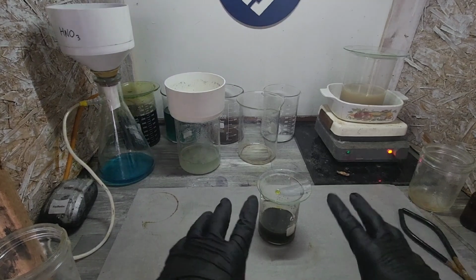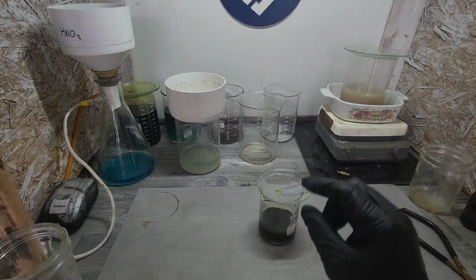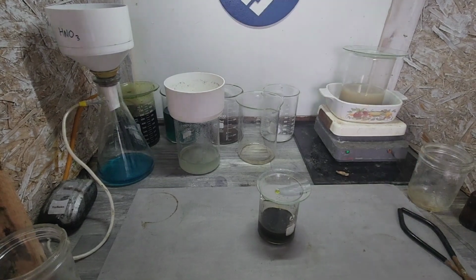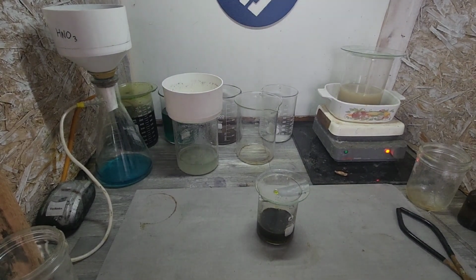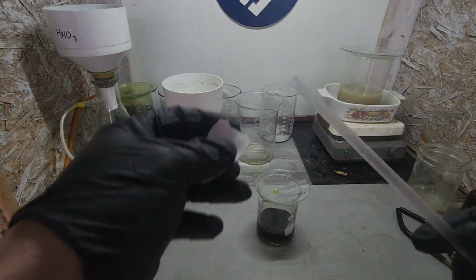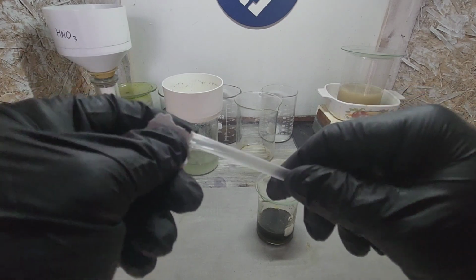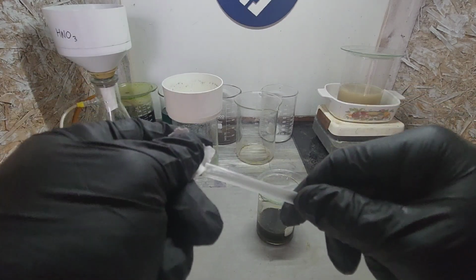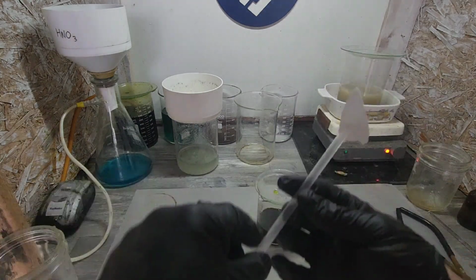All right, so this has been cooking for a little while now. I added a little bit more hydrochloric and a little bit more nitric. I think I videotaped adding the nitric. Anyways, I gotta get a Stannous test on here immediately. Let's see what we got going on. See if we found any more gold in the bigs. There it is. The scientific straw is back.